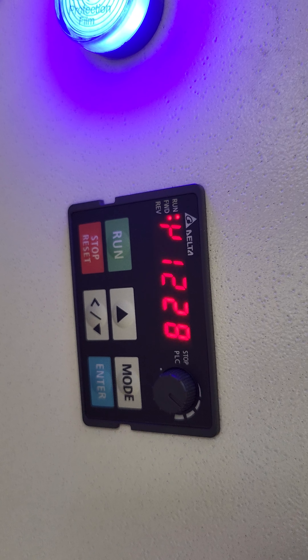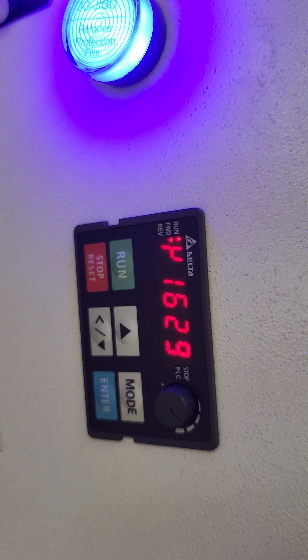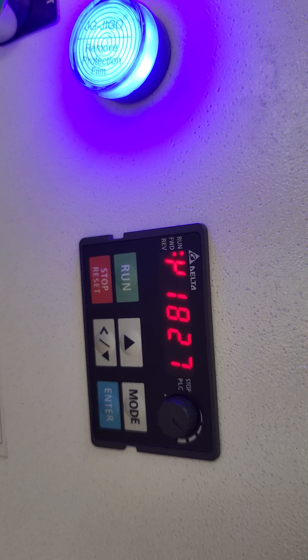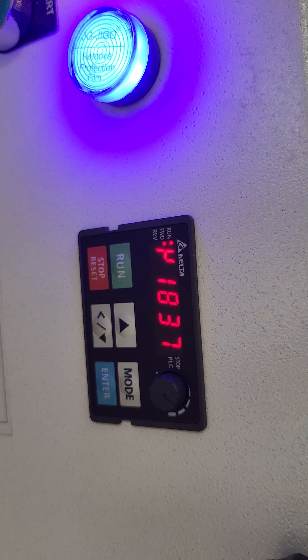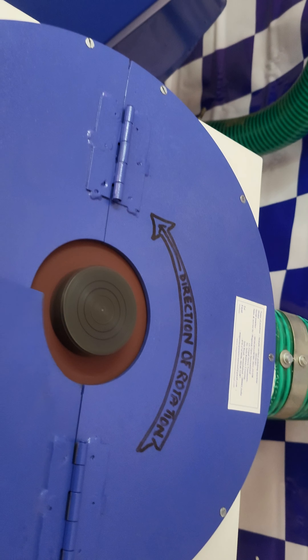The RPM ramps up: 900, 1000, 1200, 1300, 1400, 1500, 1600, 1700, 1800 — that is the operating speed of this machine.